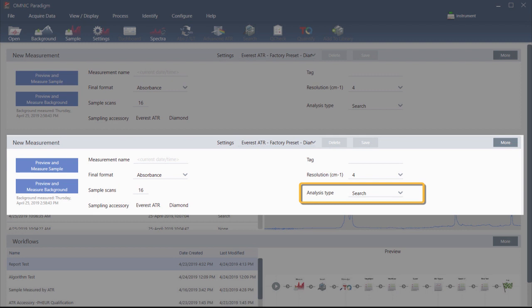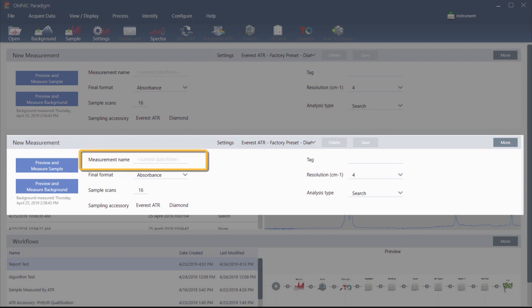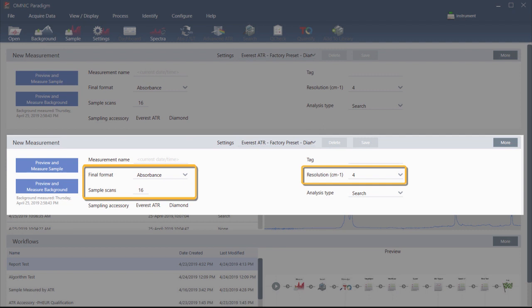The quality of the output depends on the source and quality of the spectra in the selected libraries. Next, enter a measurement name, or you can leave the suggested name, which is the exact date and time of the measurement. Finally, check the acquisition settings. These are all good starting values for the analysis.